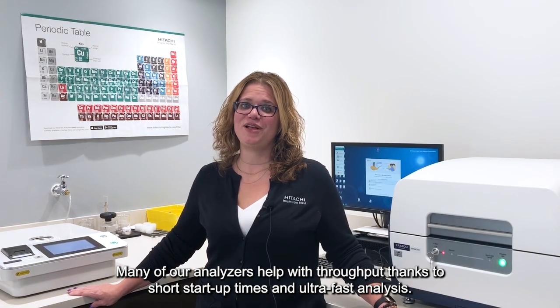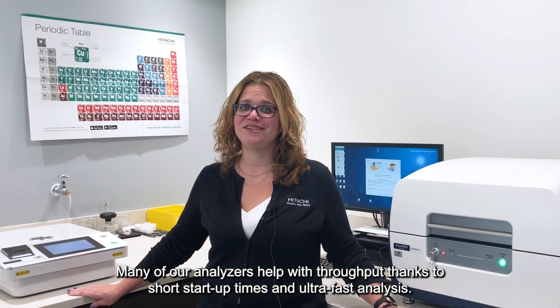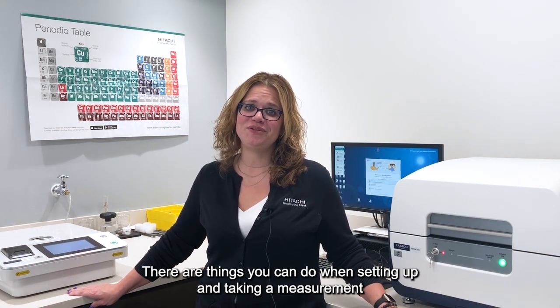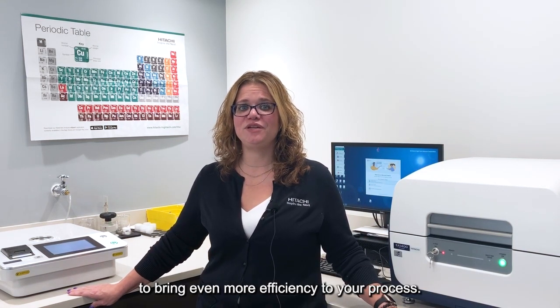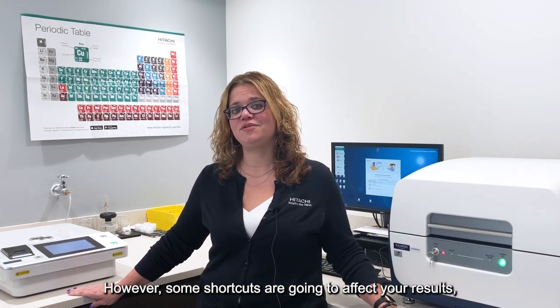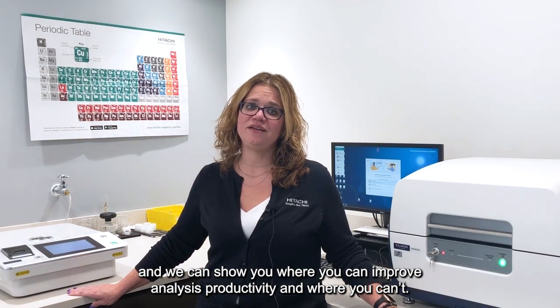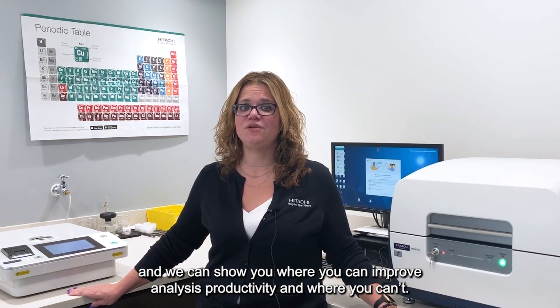Many of our analyzers help with throughput thanks to short startup times and ultra-fast analysis. There are things you can do when setting up and taking a measurement to bring even more efficiency to your process. However, some shortcuts are going to affect your results, and we can show you where you can improve your analysis productivity and where you can't.